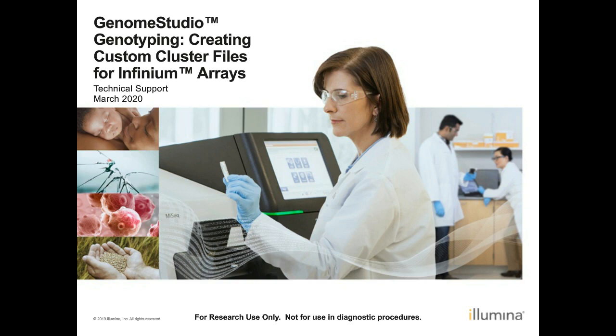Today's topic is GenomeStudio genotyping, creating custom cluster files for Infinium arrays. Let's get started.